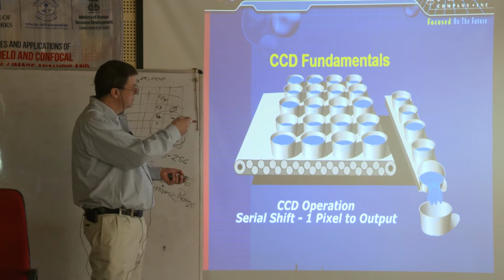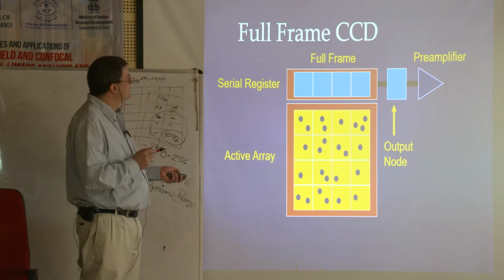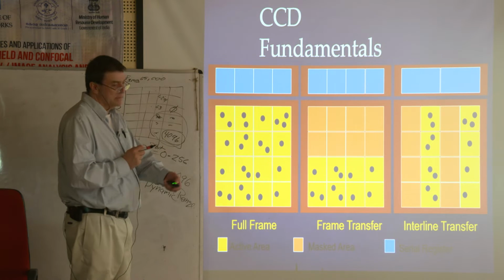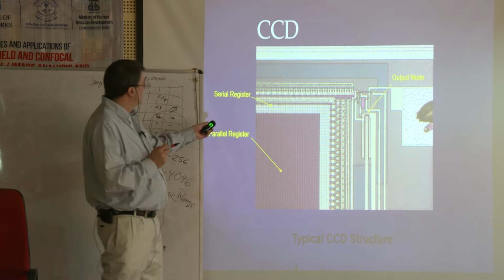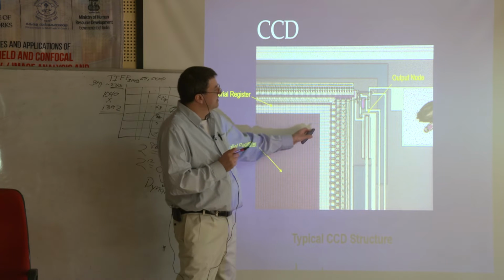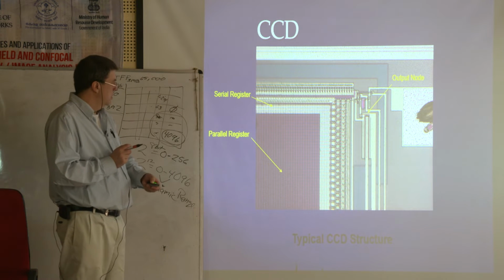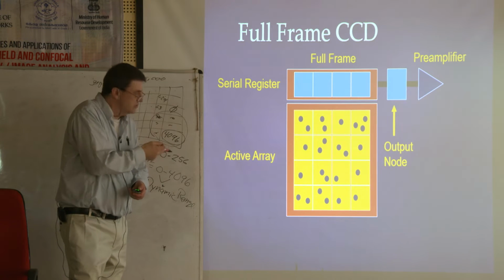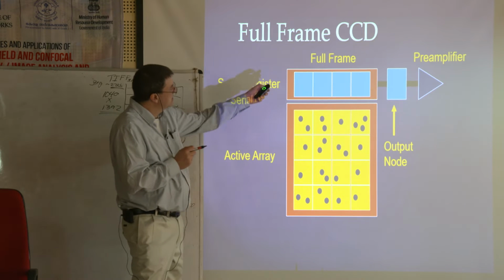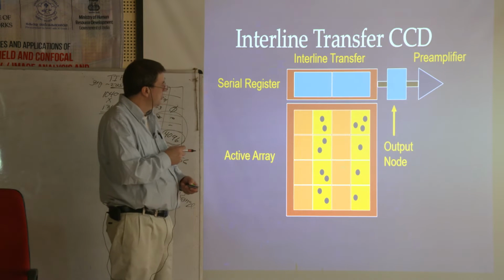Okay. So again, just different ways it dumps the pixels out. This is actually looking at like a... Whoops. I got a clicker finger today. Okay. So basically here is just what it actually looks like physically, the chip, okay, at more of a microscope level. But again, it's just photons being changed into electrons producing a number. That's really all a digital camera is. These are different kinds of designs, different ways the cameras are designed. Okay, and it's showing the electrons getting pushed out.